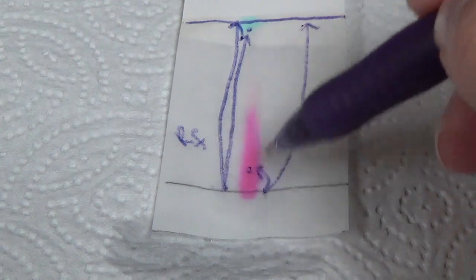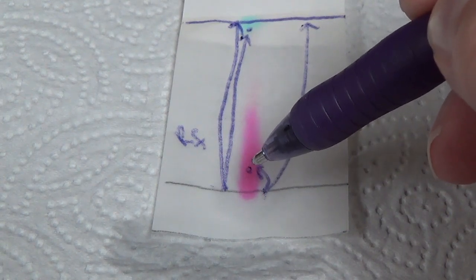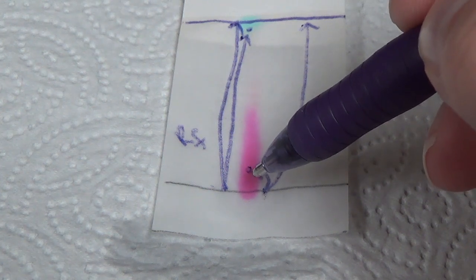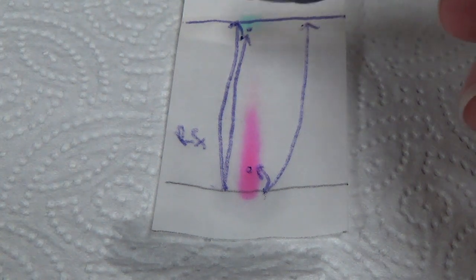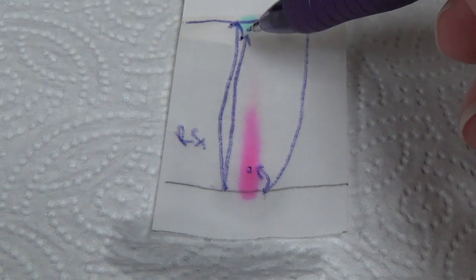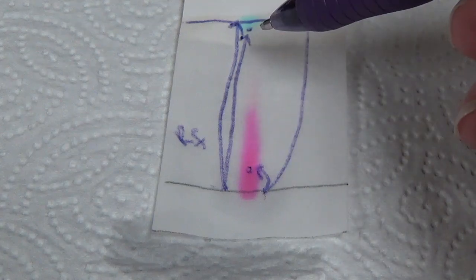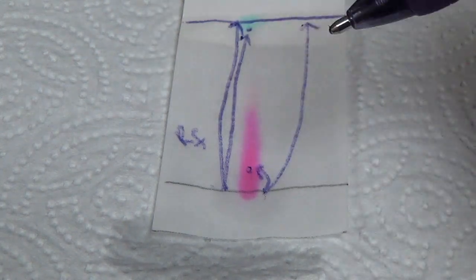Since the pink did not move a lot, it must be more attracted to the stationary phase, the paper, than the mobile phase, the water. And the opposite, since the blue traveled a lot, it must be very well attracted to this movable phase, the water, and not so attracted to the stationary phase. And so we could do this for almost anything that's a mixture of things that we have a movable phase and a stationary phase for.